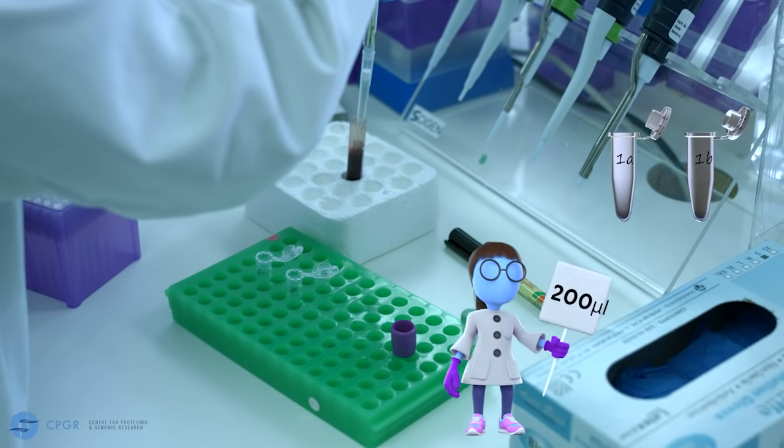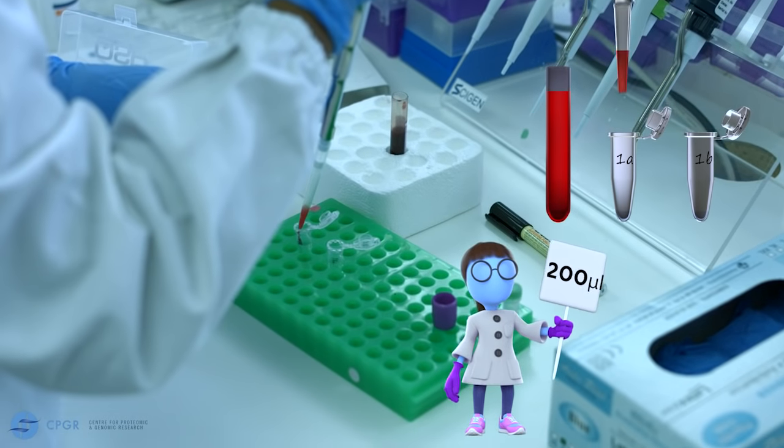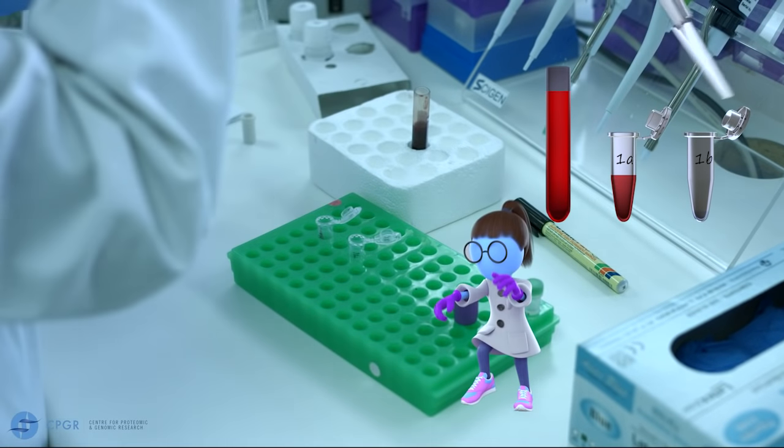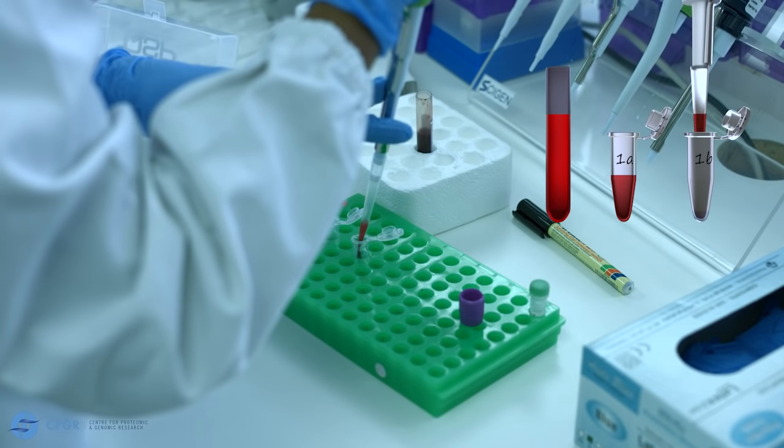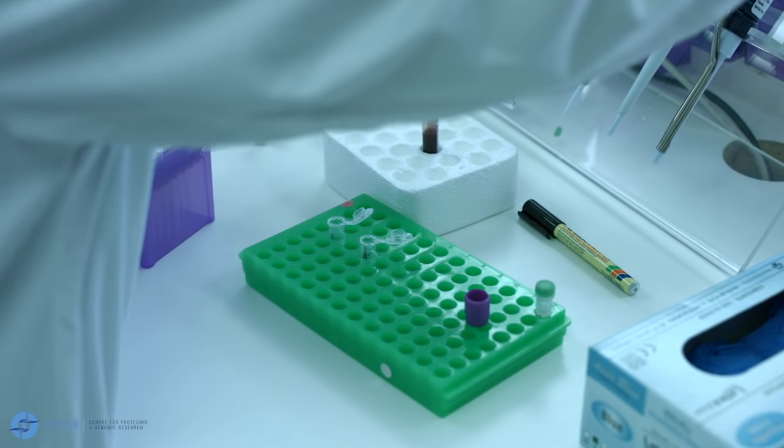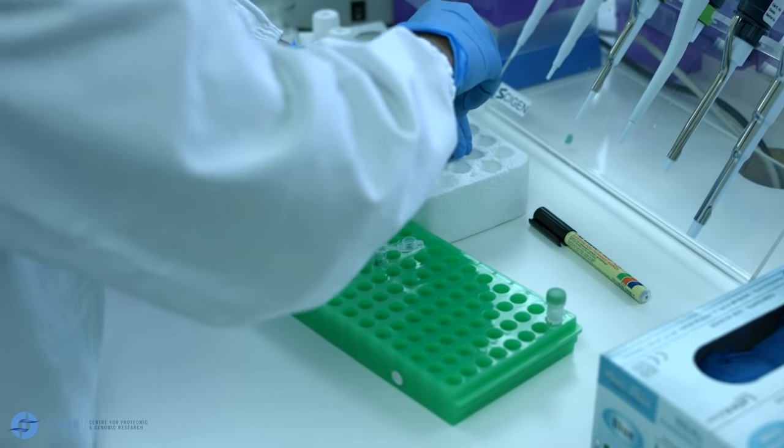Pipette 20 microliters of proteinase K into each microtube. Pipette 200 microliters of blood into each tube. Do this slowly as blood is viscous. Cap the blood sample and put to one side.